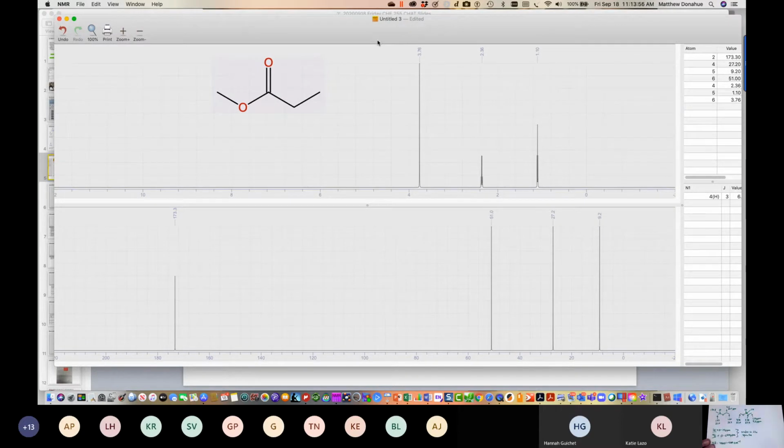So when we're asked to differentiate these by proton NMR, notice the big thing, which I'll highlight in red. See this CH3 group, how it's directly bonded to the carbonyl. That occurs at 1.97. Now you have a CH3 group here, which is bonded to oxygen, and that occurs at 3.76. So what we are aiming to understand is that even though you have a CH3 group here and here, the chemical shift is different, right?